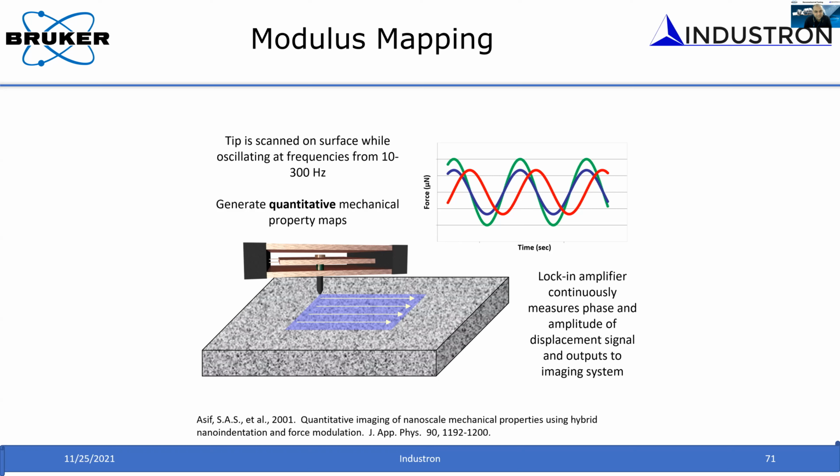Another question: at high temperature, do we need to change the indenter tip or keep it the same as room temperature? Yes, we need to. Depending upon the material you use, you need to change the tip material. Sometimes you use sapphire, sometimes diamond. If you test steel, you don't use diamond because you will lose the tip because of diffusion of carbon. In such cases, we use sapphire tips. Sometimes we use silicon carbide. So depending upon the material, the tip material will be different.